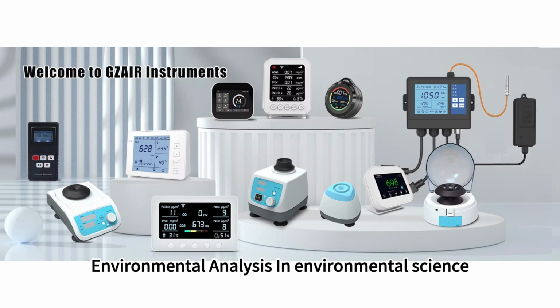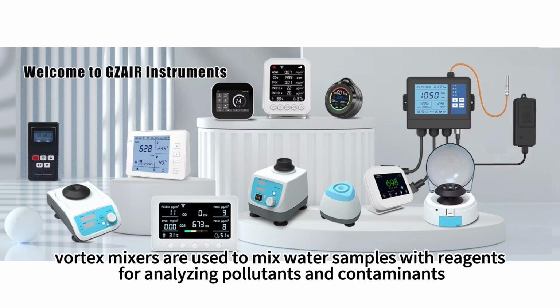Environmental analysis. In environmental science, vortex mixers are used to mix water samples with reagents for analyzing pollutants and contaminants.